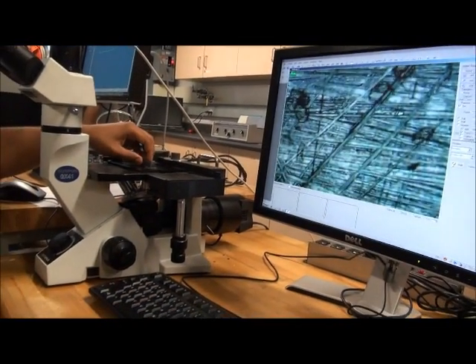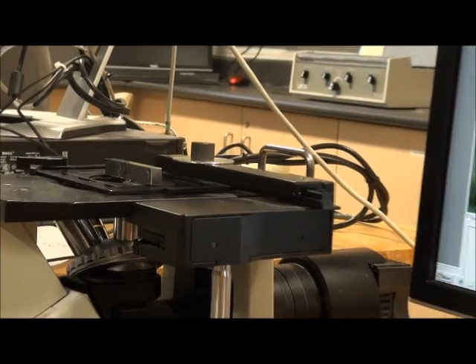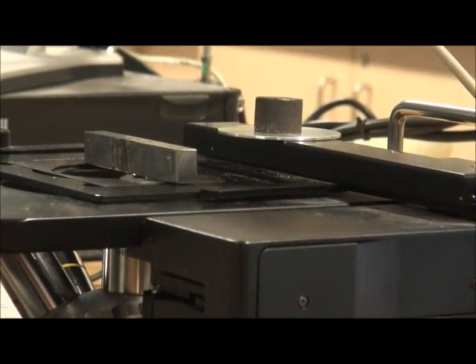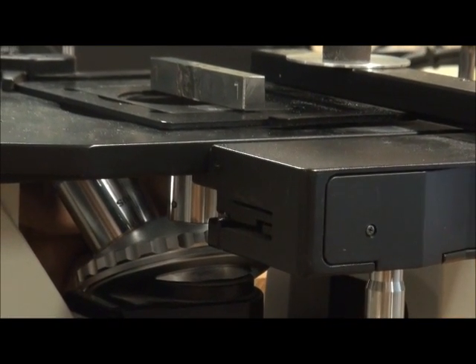And moreover, for the transition where there is transition from the heat affected zone to the weld zone, we usually take the low power lens as we want to get the picture of the bigger area.